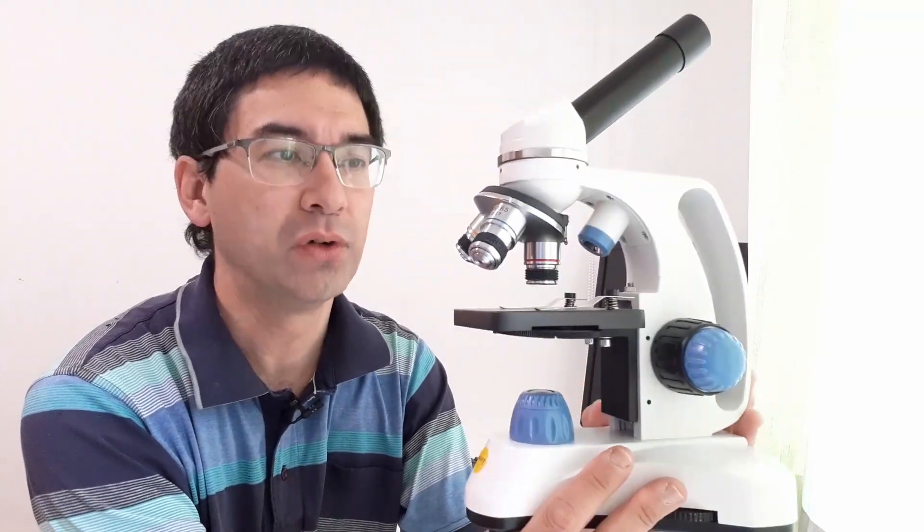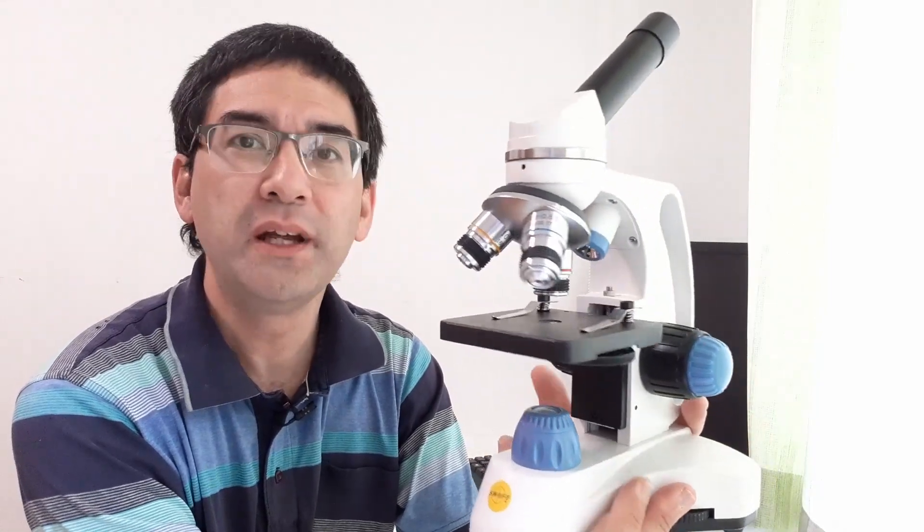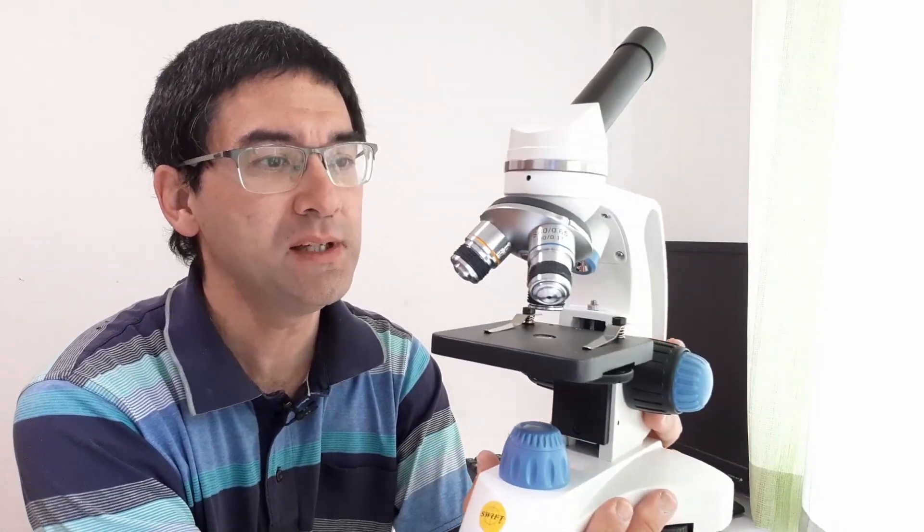It's quite useful for educational use. It's pretty low cost, only around 100 euros or 100 US dollars. But for that amount of money you get quite a bit of microscope. I was actually quite surprised.